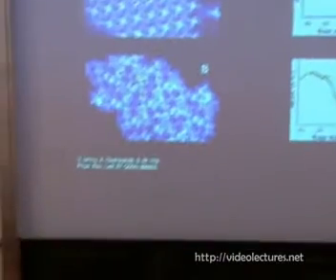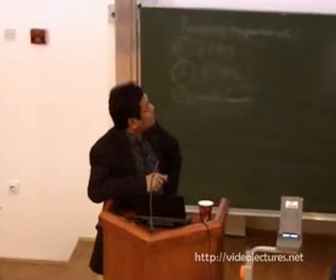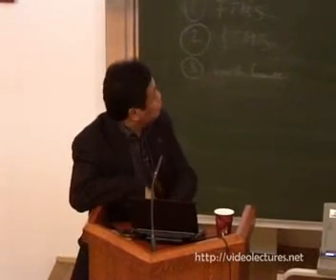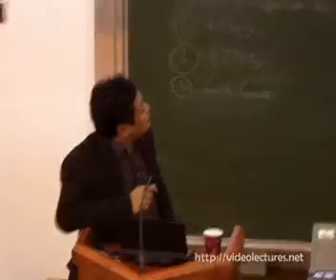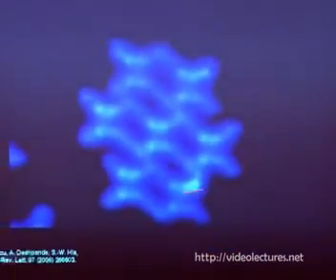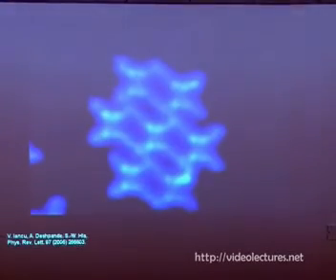So in order to understand that, we have to find out. What we did is create a small hexagon by removing molecules from a ribbon with the STM tip. We have this kind of hexagonal unit. I will just briefly show this movie again. We move the molecules with the STM tip. We call it two-dimensional sculpturing. And we get this hexagonal unit formed from 7 molecules.